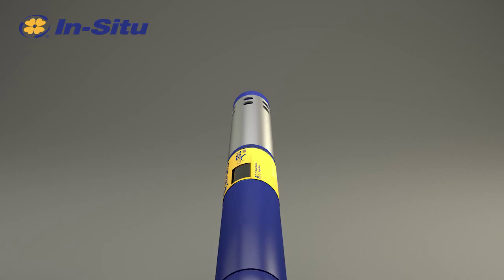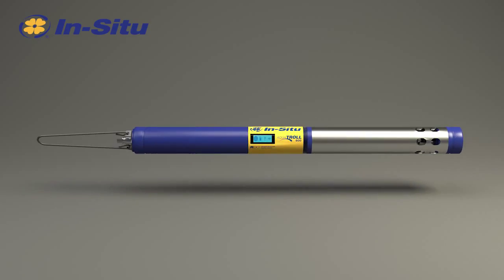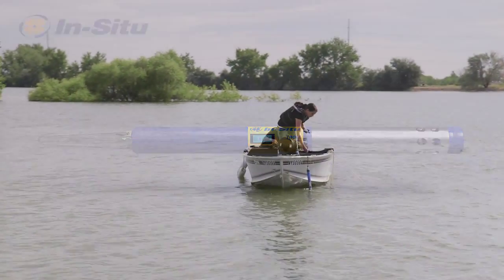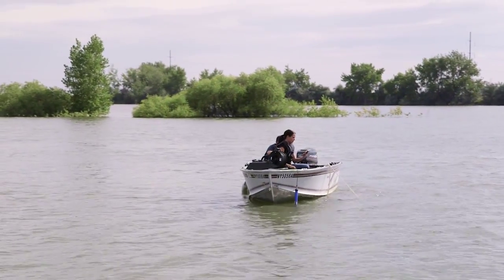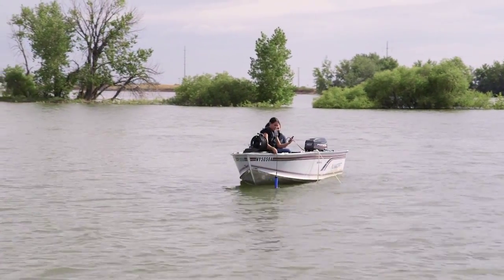In-situ is proud to bring you the newest advancement in state-of-the-art water monitoring technology, the Aquatrol 600 multi-parameter sonde. It is rugged in groundwater and corrosion resistant in surface water, delivering accurate, reliable data in an easy-to-use, flexible instrument that performs for years.